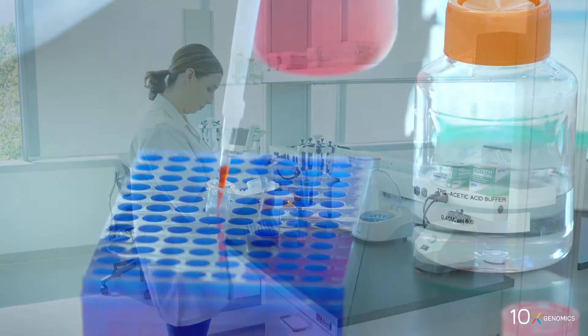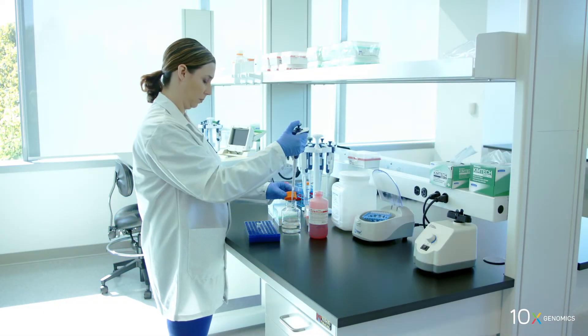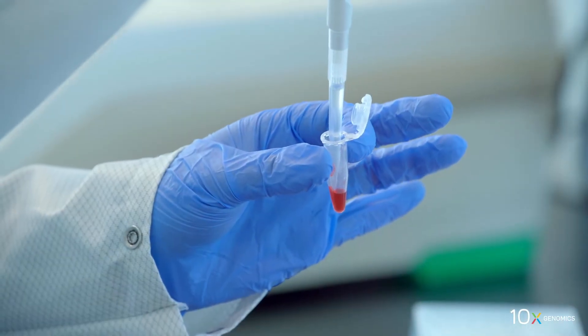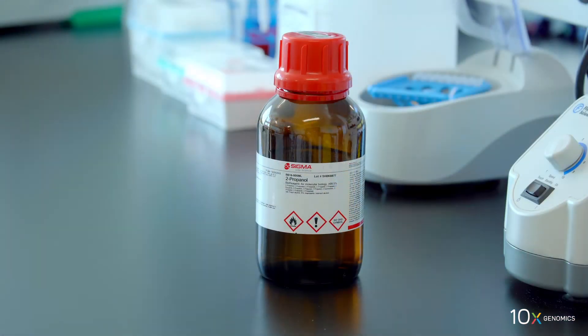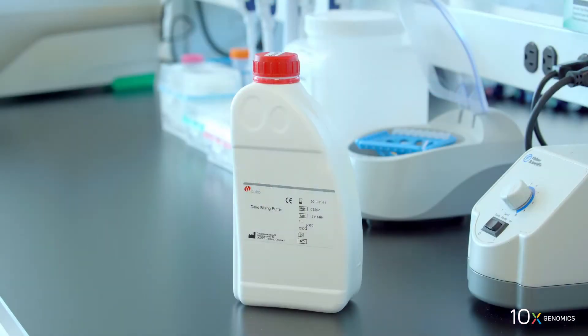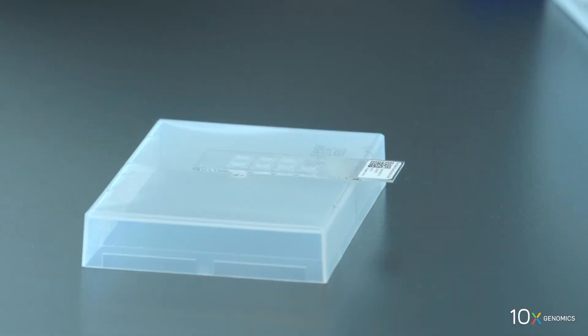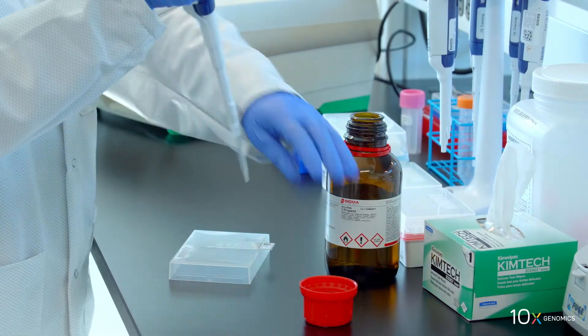Next we will prepare the eosin mix. We combine eosin and tris acetic acid buffer in a microcentrifuge tube — refer to the user guide for buffer preparation instructions. We also have isopropanol, hematoxylin, and bluing buffer. Finally, we have our Visium spatial tissue optimization slide with the tissue sections. We are ready to stain the tissue.